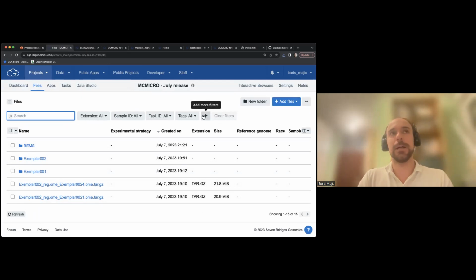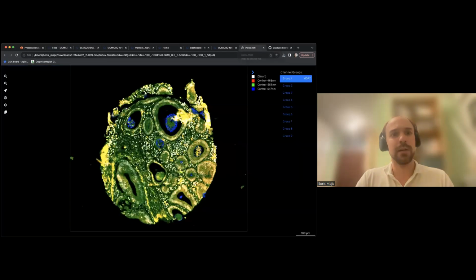It only tracks these files locally. So instead of downloading these hundreds of files, you can just download one archive, which will then contain this HTML report. Then you can open it locally, and this is how one of these reports looks.